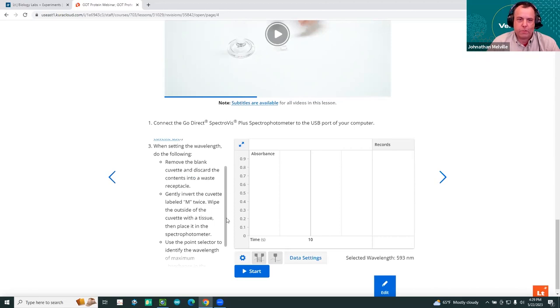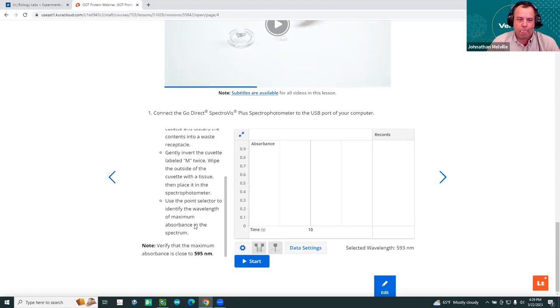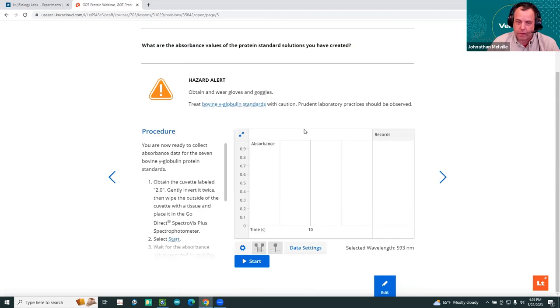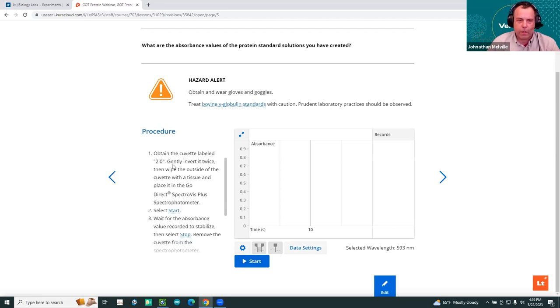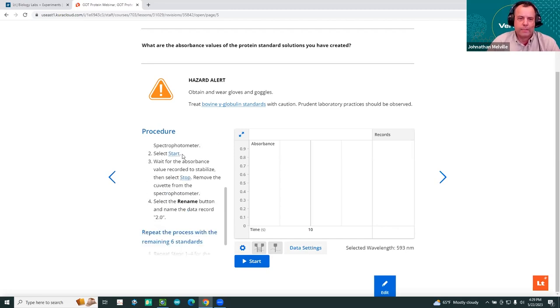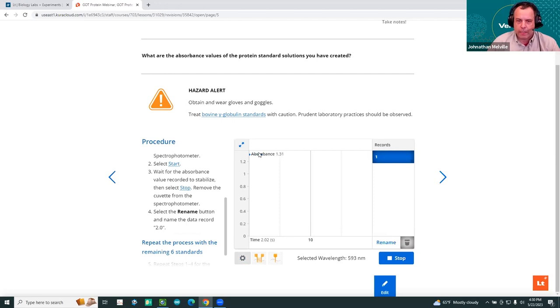Next, I'll remove the calibration cuvette and put in a sample that's been reacted with Bradford, because we need to know which wavelength to track to create our standard. I'll insert the reacted sample and hit Continue. It's going to show us a full wavelength spectrum so we can select our measurement wavelength. There's the full wavelength spectrum — the peak looks like it's right around 590–598 nm.